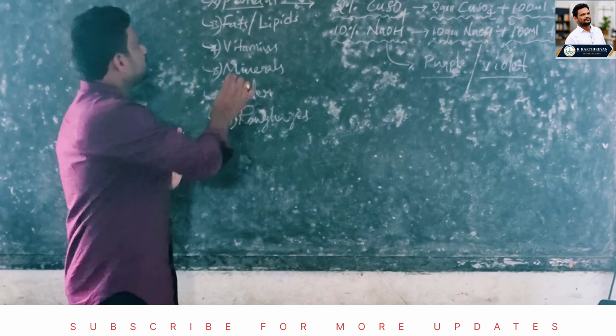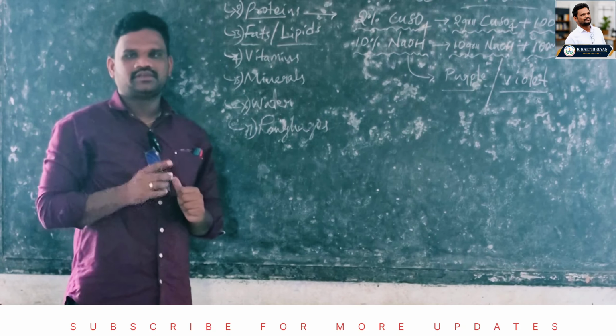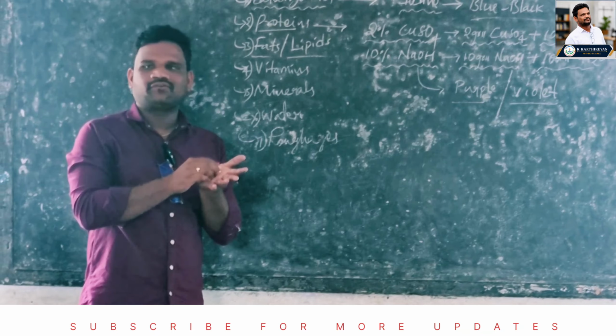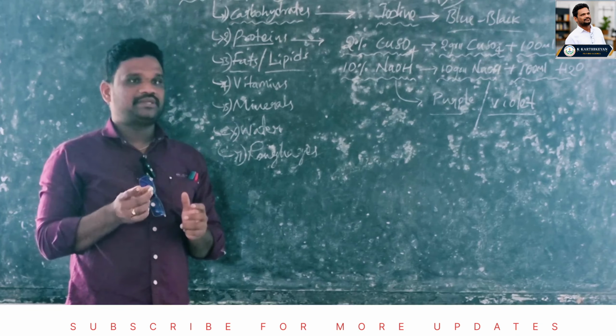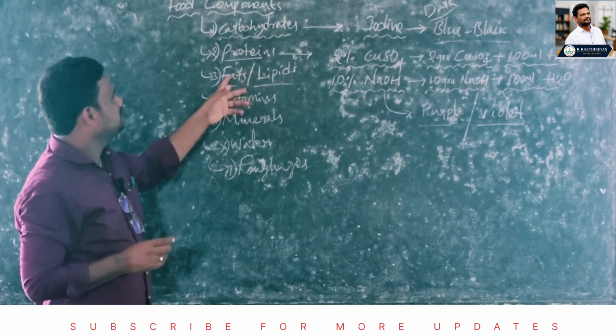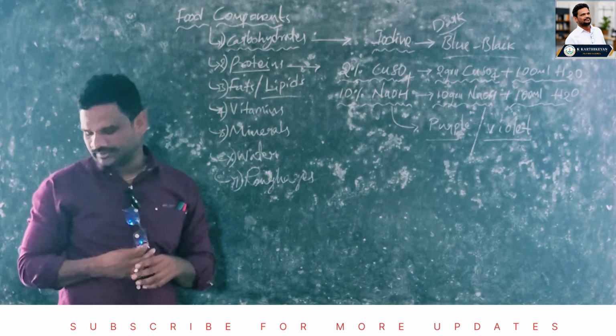Okay. Now the third one, fats or lipids. For fats or lipids, we do one experiment. With the food material, we have to rub on white paper. Then it turns translucent, which means that the food material contains fat. Okay? These are the 3 tests. Now let us see them by a practical experiment.